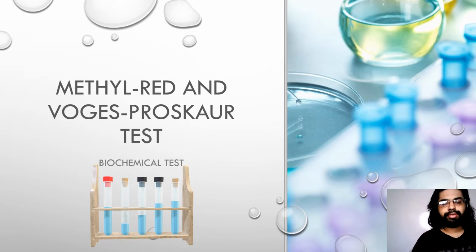Hello, in this video I will talk about an interesting biochemical test that is performed on microbes to categorize them. The name of this test is Methyl-red and Voges-Proskauer test, MRVP test in short.